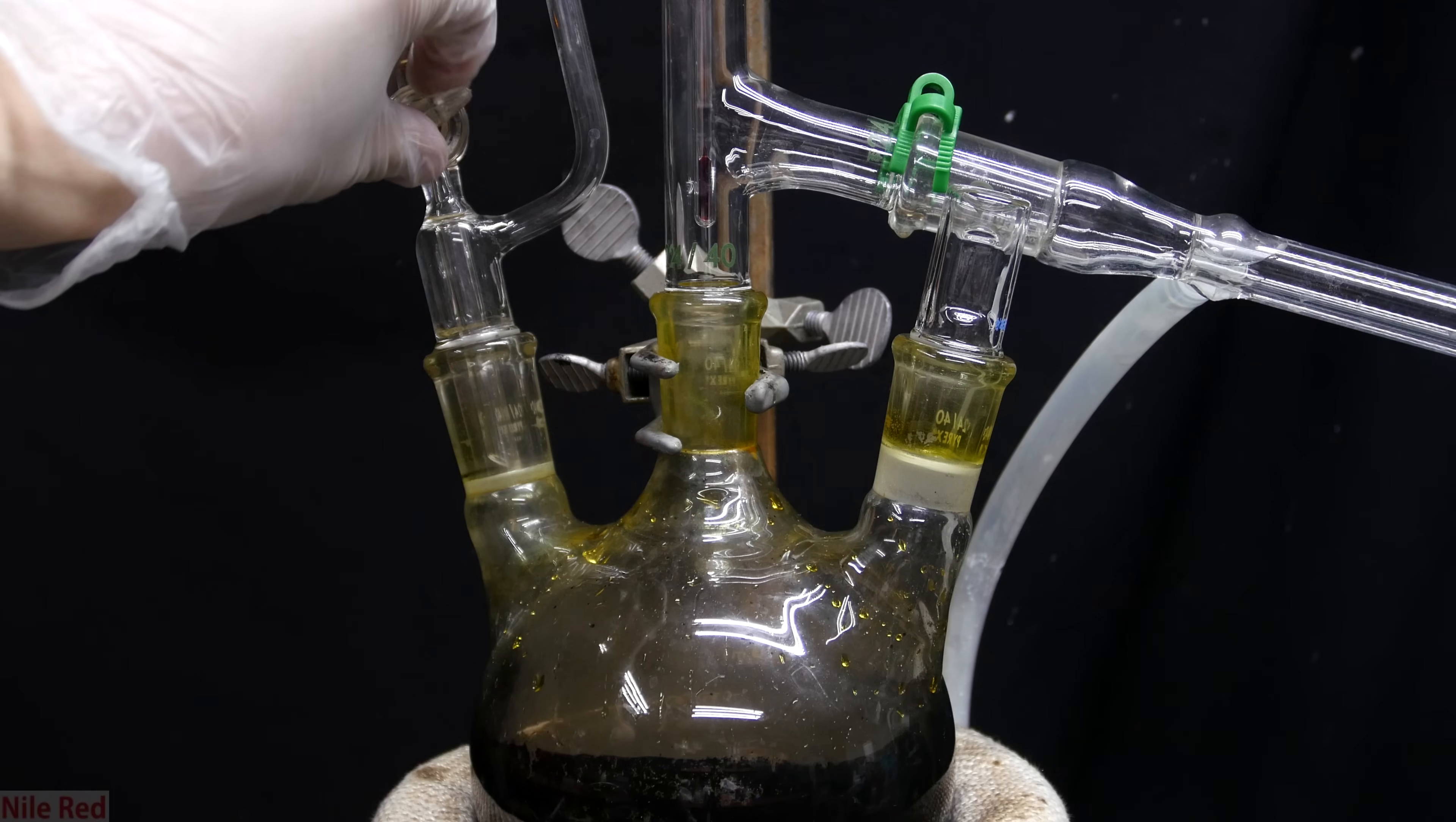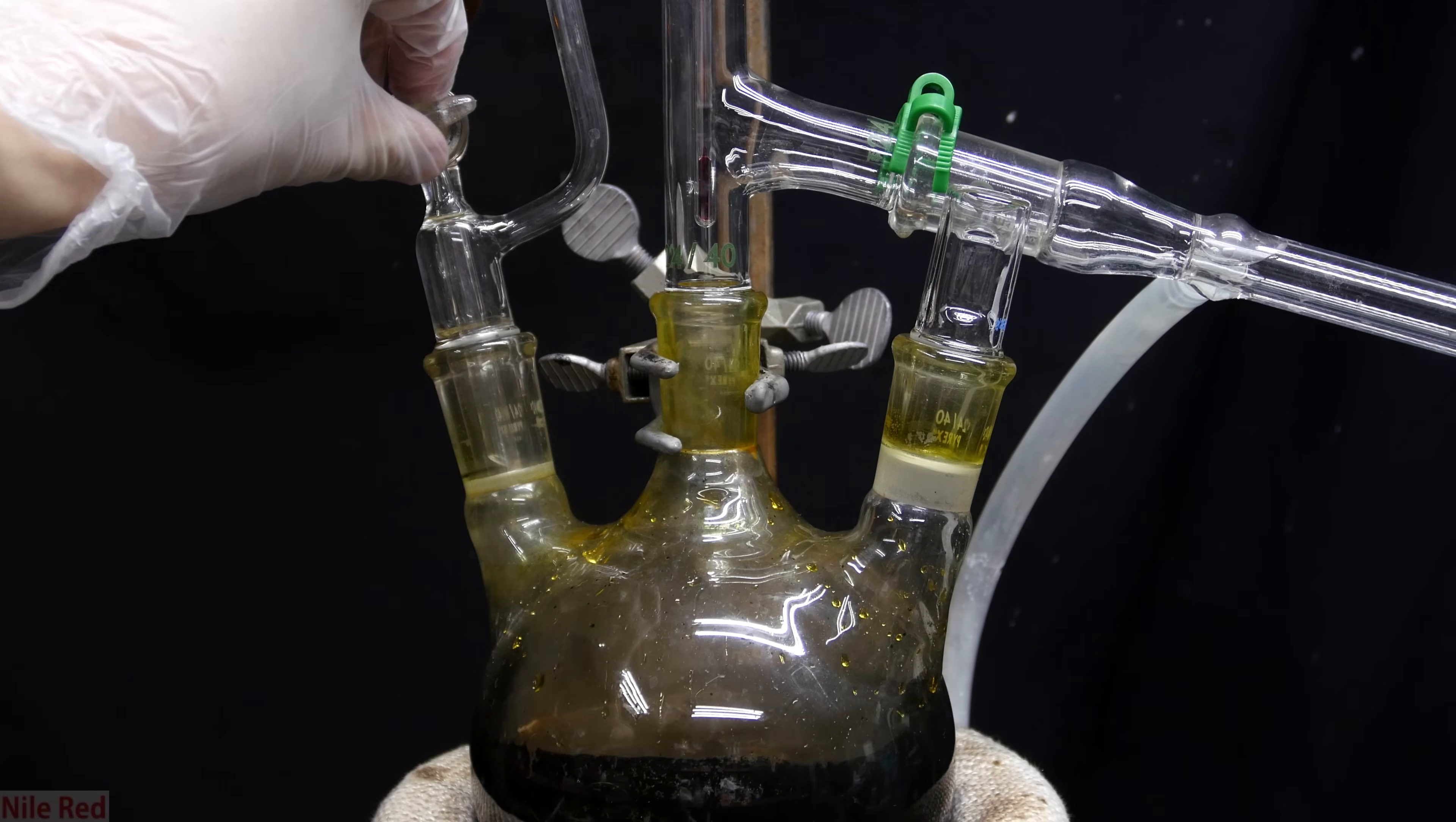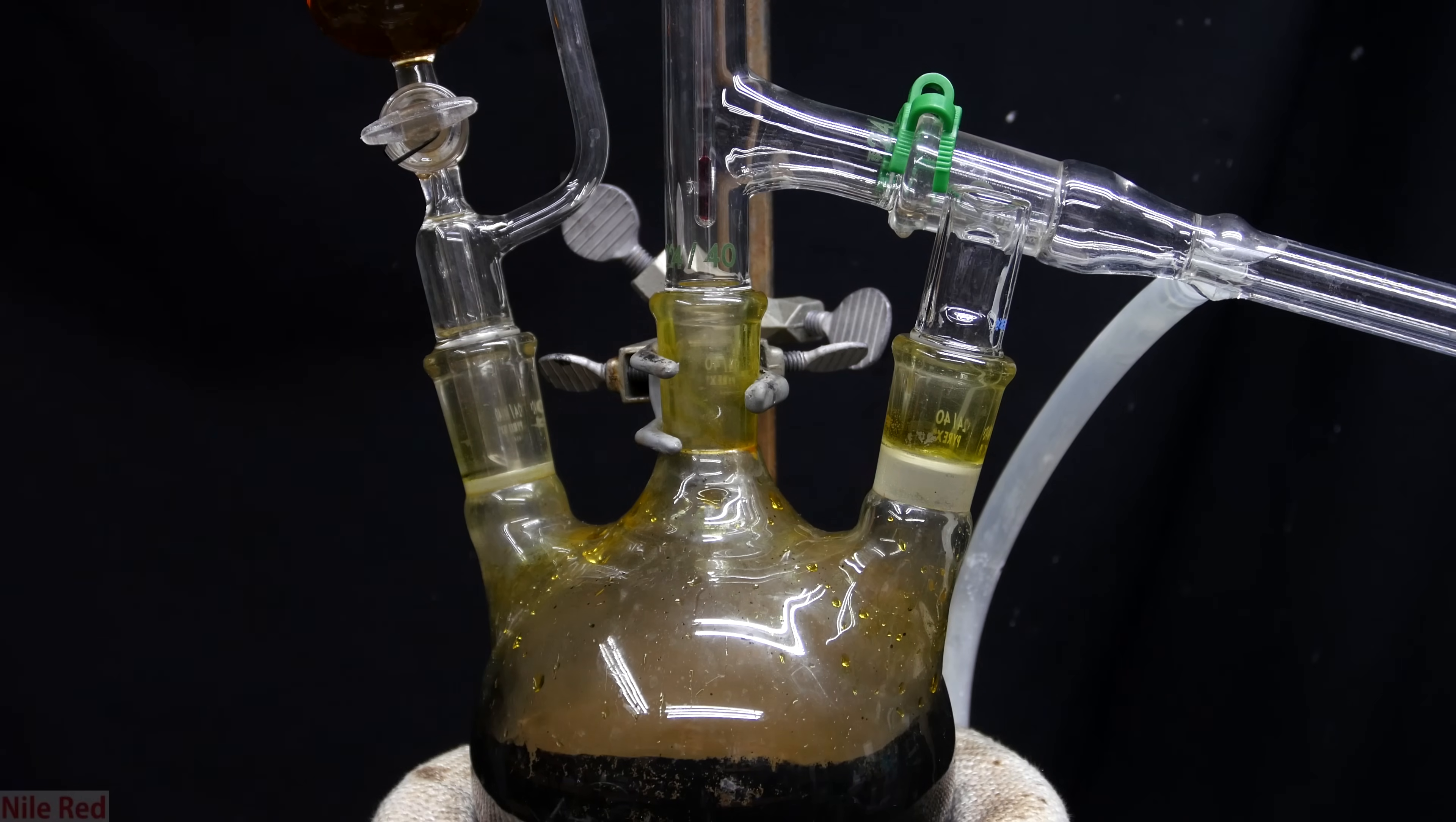It's important to have very strong stirring to make sure that the sulfuric acid that's added gets thoroughly mixed. To do this, we're using that magnetic stir bar that I mentioned earlier, and I have a magnetic stirring plate that's running below. It has a spinning magnet in it, and the magnetic stir bar will follow it as it spins.